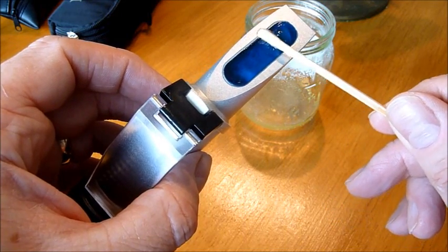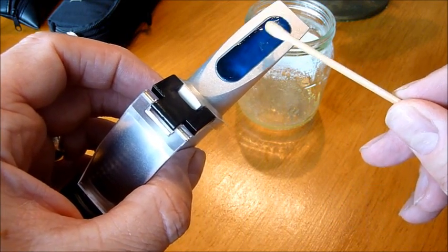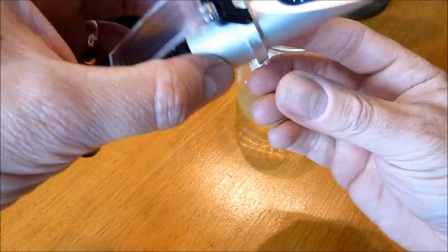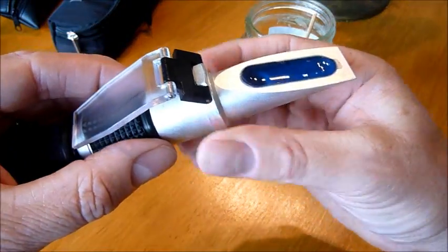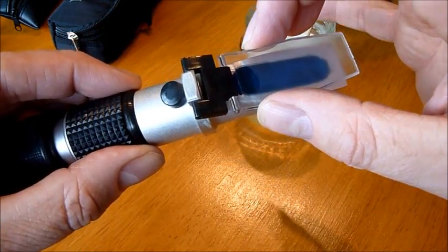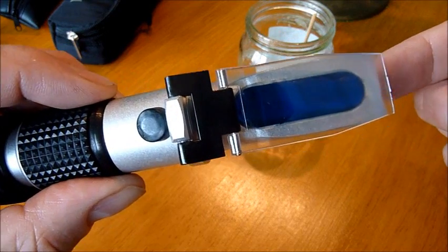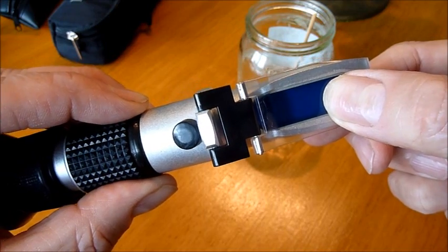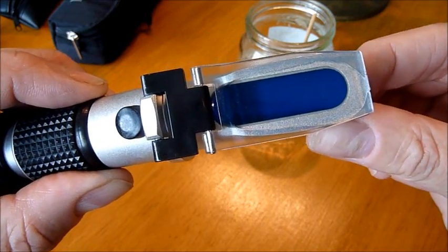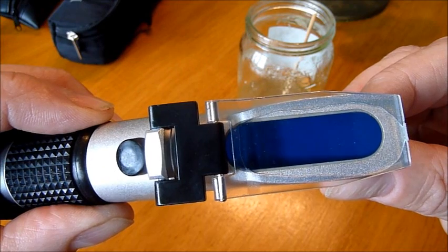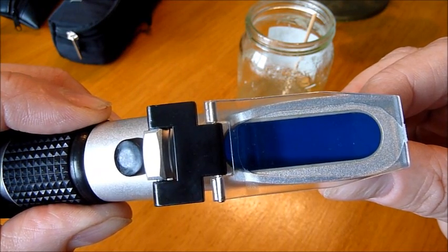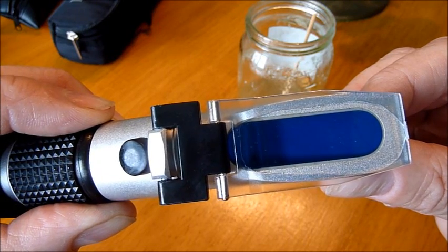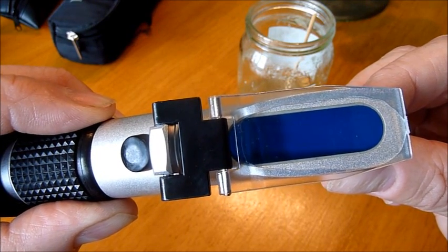The one thing you definitely don't want is any air bubbles because what you're interested in measuring is the interface between the honey and the prism which is where you get your refractive index from. Now hopefully you can see this as you push the cover plate down. I'm pushing honey out around the prism and I've got a full contact between the honey and the prism. That should ensure that there's no air bubbles. That should give us a good clear defined reading.